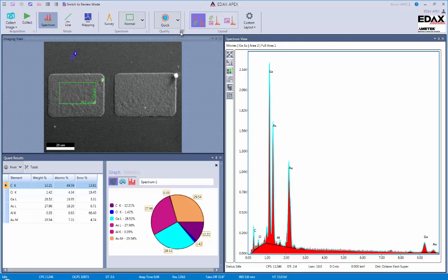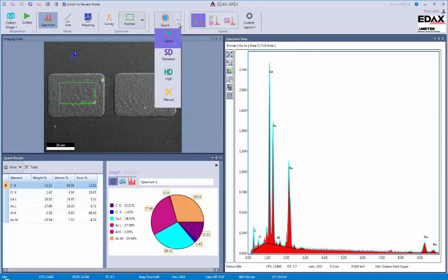The next area that's useful is our quality settings. And these allow us to determine how long we're going to collect our data for. In this case, it will be for however long we're collecting our spectrum for.